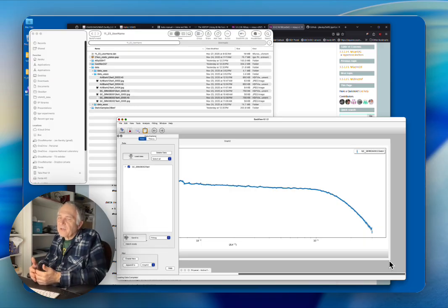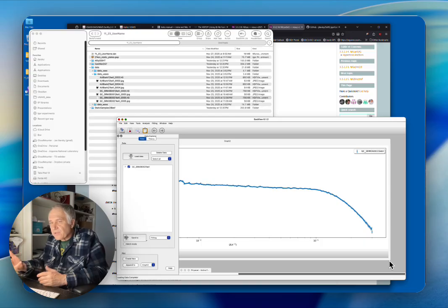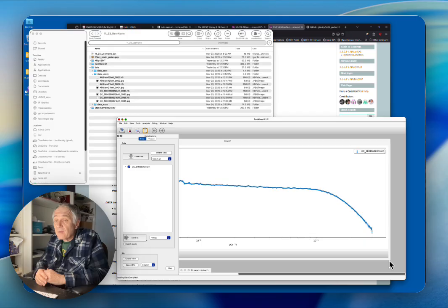So a standard-adhering consumer application like IRENA in Igor, or like SAS view, or anyone else, or a Python program, you can read them via the Python interface, can pick up the data and just use them directly. There is no further data reduction needed at all.